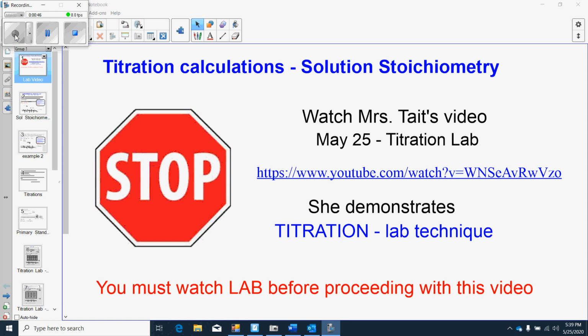And please, you need to take a look at that video first and her process of titration before you move forward in this video. So if you want to stop now, take a look at her lab, and then come back. We are going to talk about the quantitative side of titration. So once you collect your data, how can you use that data to continue on and find the concentration of unknown solutions? Okay? All right.